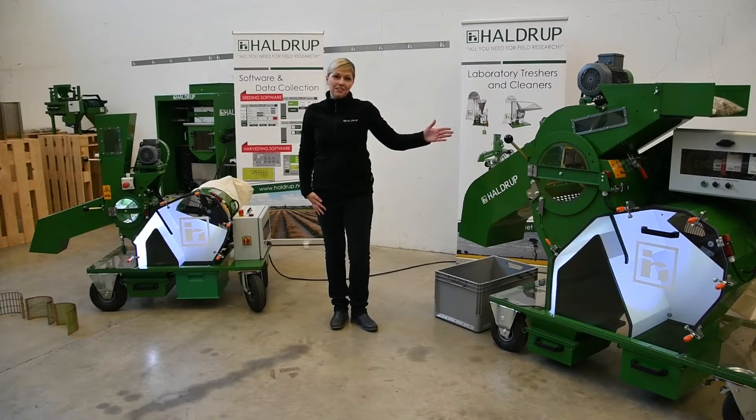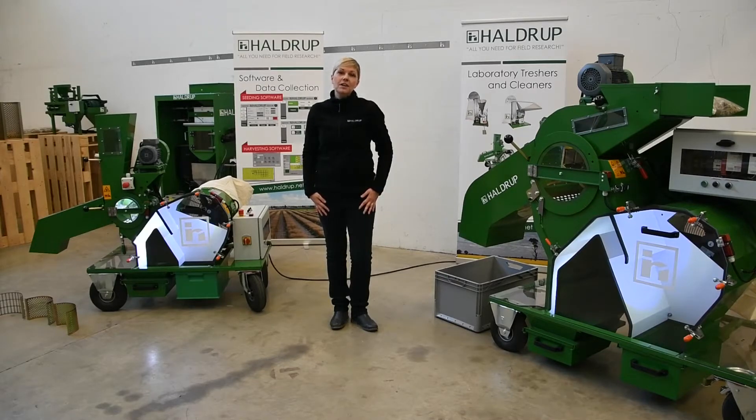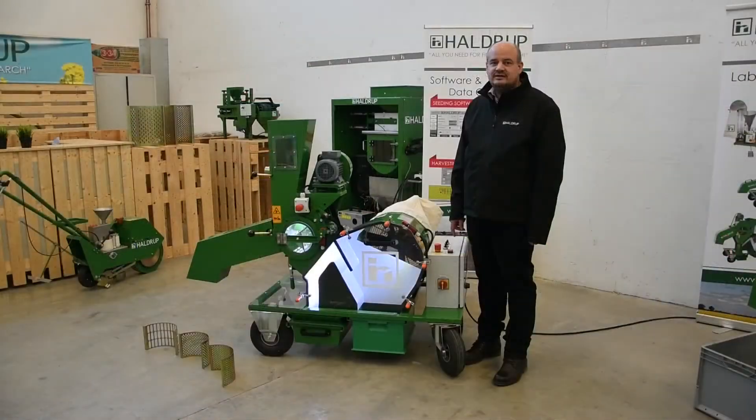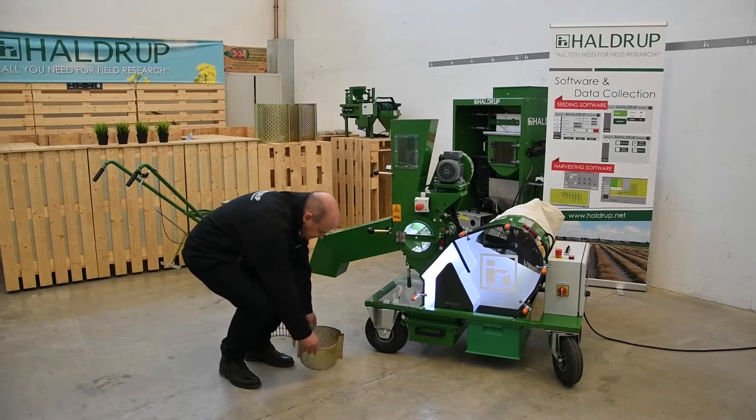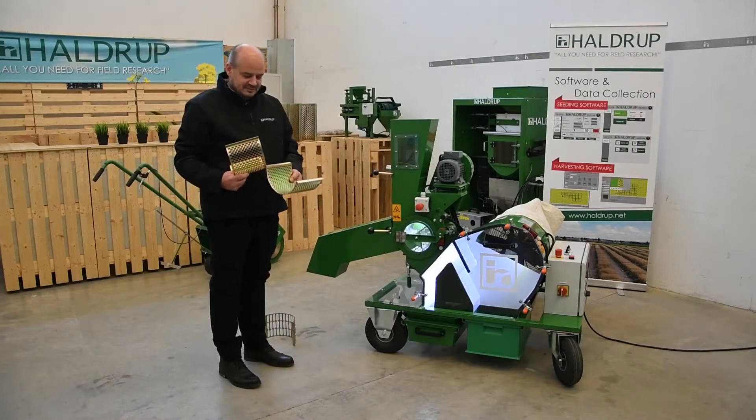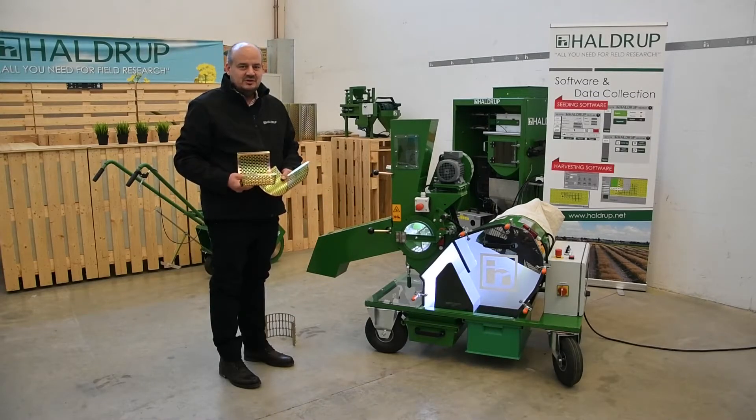A larger one is the HALDRUP LT35, which has a 35-centimeter threshing unit, and then we also have a bigger laboratory thresher, the HALDRUP LT50, with a 50-centimeter threshing unit. This machine is perfectly suitable for threshing plants that are difficult to thresh, like barley or sesame. We offer different kinds of concaves for these machines, from 1.5 millimeters up to 18 millimeters, or also customized concaves.